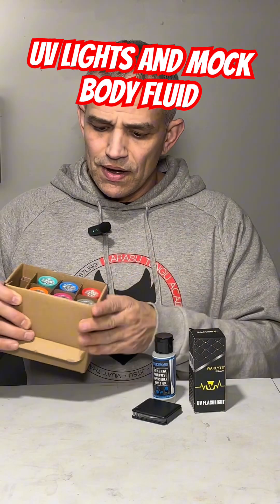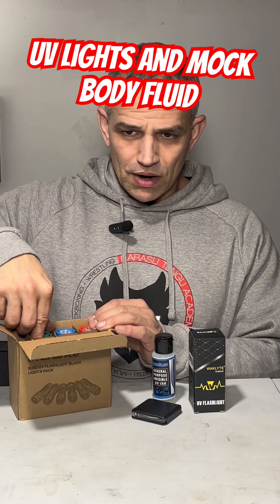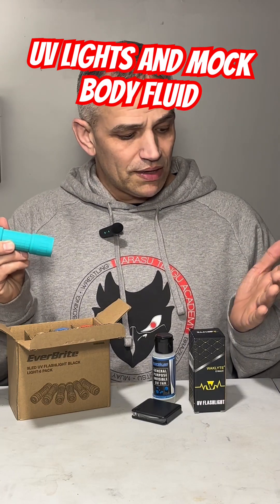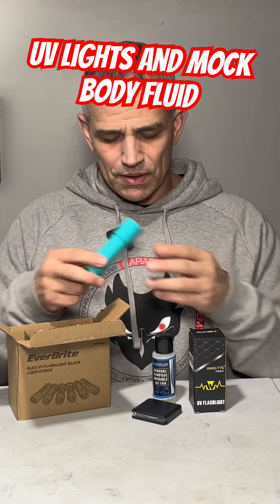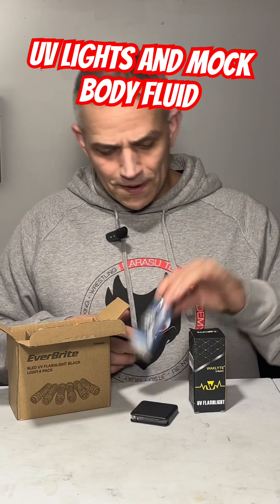I got another one here. This one came with six in a box with the batteries and they were under 15 bucks. They're actually pretty sturdy — I was surprised at the quality of them. I've gotten these before; you can get them in a 10-pack and they haven't been really great, but these are actually pretty good and they're pretty bright.